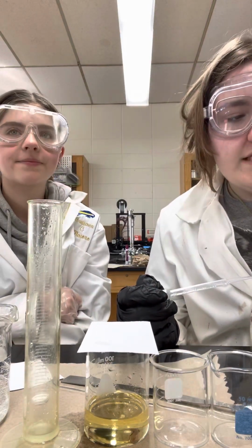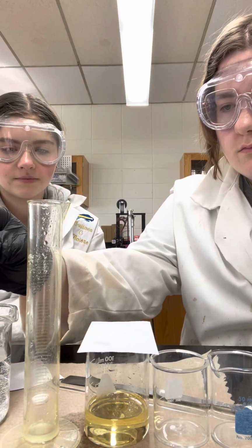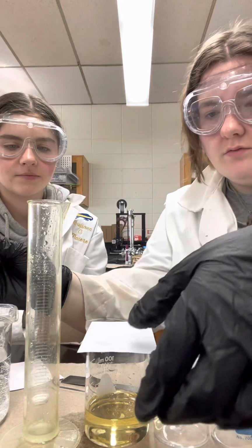Perform. Measure out 10 milliliters of water into your graduated cylinder. Let me get a level.